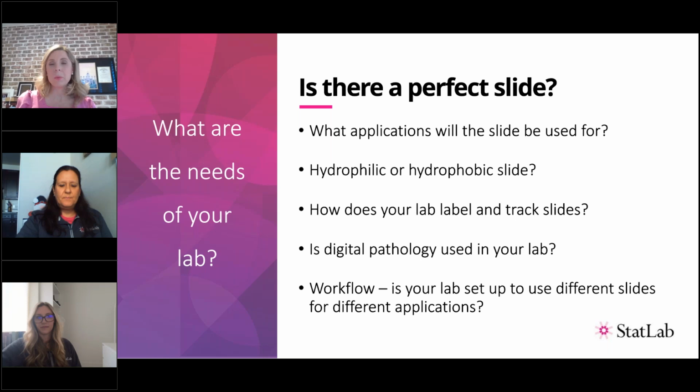How that slide picks up in the water bath can impact your workflow. What kind of printer do you have? Or do you have a labeling machine? The paint that's on that slide can impact how you're able to track that patient information adequately. Is digital pathology used in your lab? More and more labs are going to it, and they're having to change some of their consumables to accommodate the newer technologies. And then workflow. Is your lab set up to use different slides for different applications? Or are you looking for one slide to rule them all? Are you looking for one slide that can do everything? So we'll talk through more on this. Next slide.